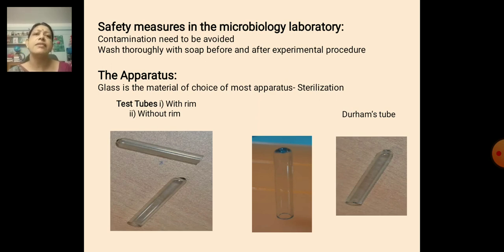For this reason, we are supposed to take those materials that can be cleaned very easily and that can be sterilized. I know that you are very much aware of the word sterilization. Sterilization means that we should keep all apparatus and all equipments away from any contamination.